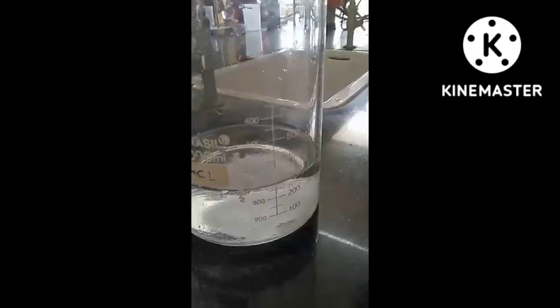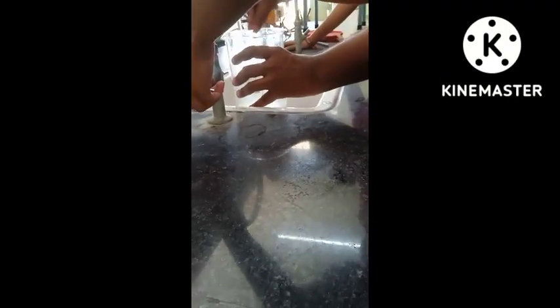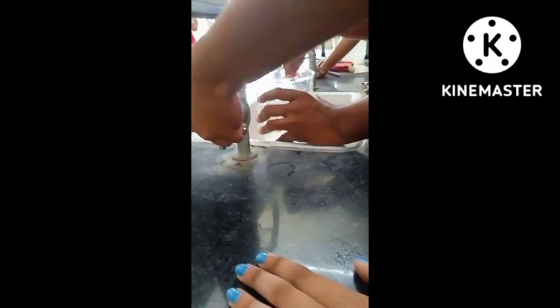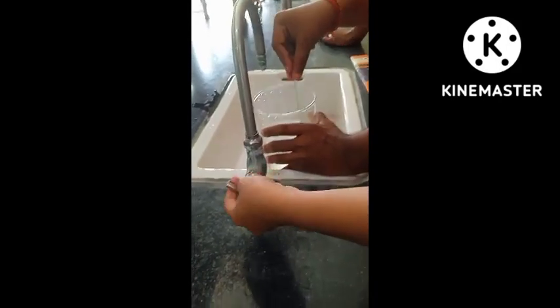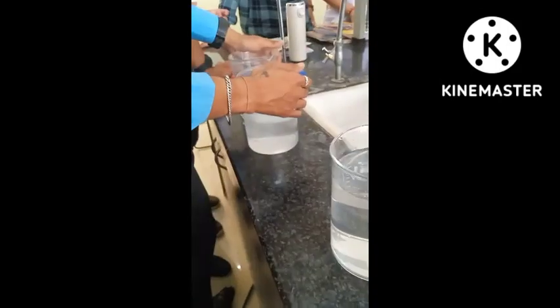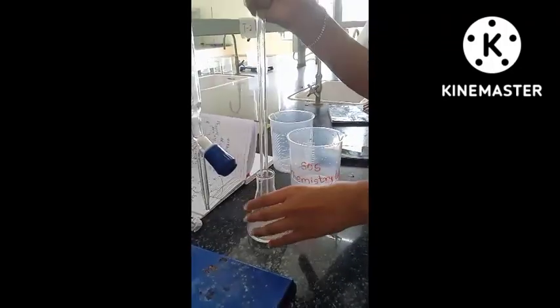So our NaOH solution is almost ready, and now we have to mix it properly. My batchmates or classmates are doing it well, and now all the solutions are ready and we have to just perform the experiments. Here one bottle is of NaOH and one of oxalic acid.